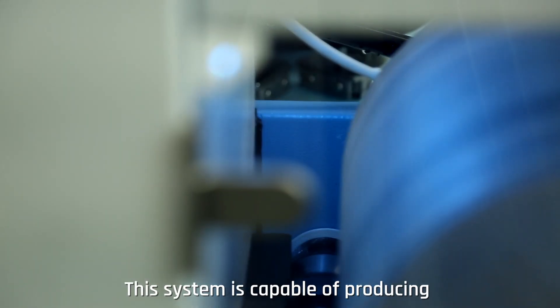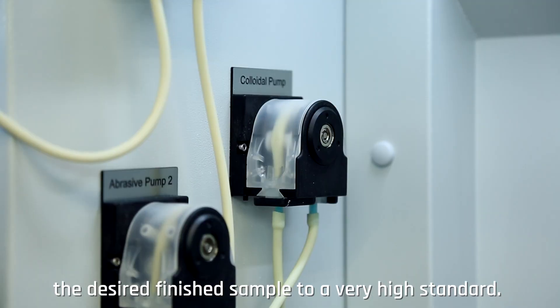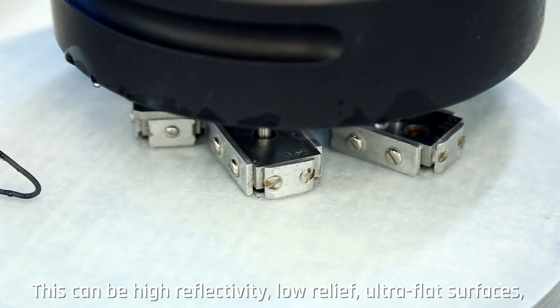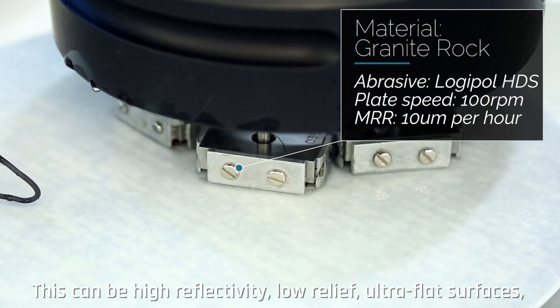This system is capable of producing the desired finished sample to a very high standard. This can be high reflectivity, low relief, or ultra-flat surfaces with minimal edge roll-off.